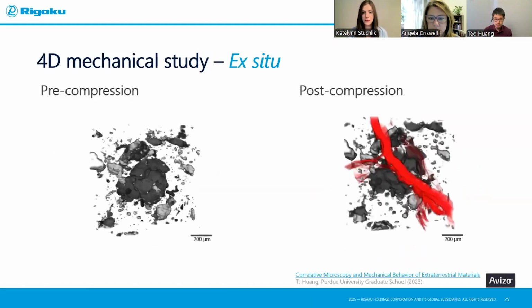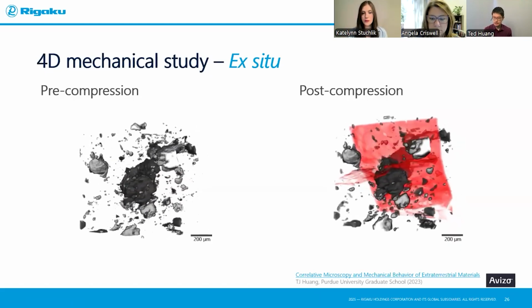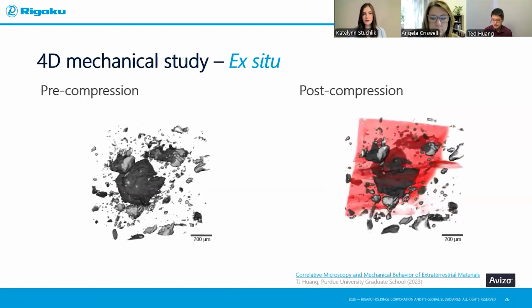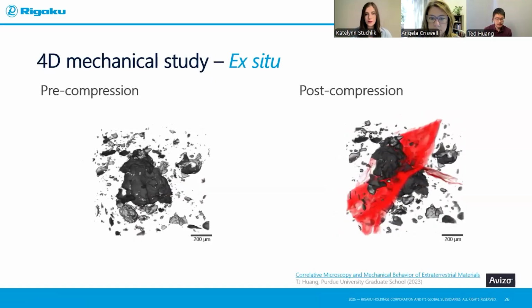So I was able to look at the internal structure, look at, oh, there are different phases in there. How do they change? So this phase 2, phase 1, how do they change and how do they interact with the crack differently? After I compress them, I can study them in more detail. But there's definitely something I still don't know, right?